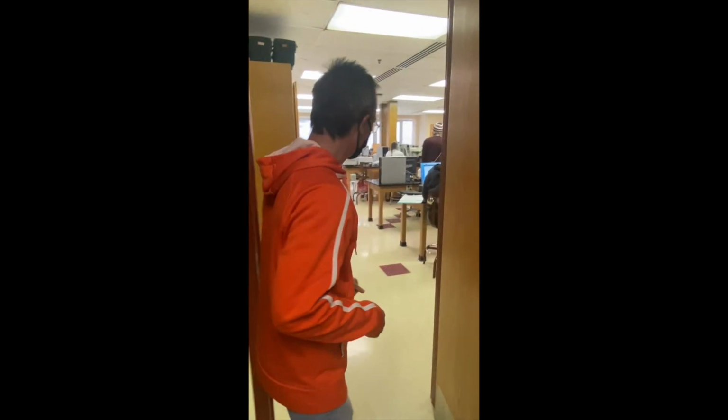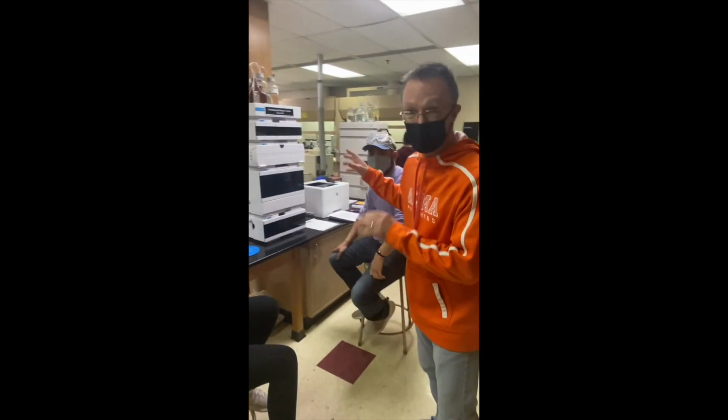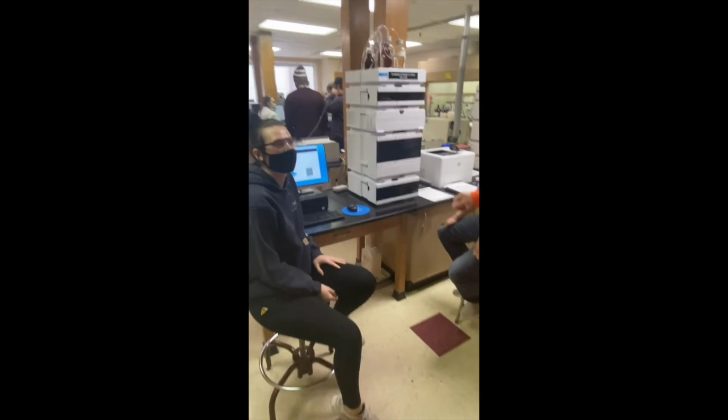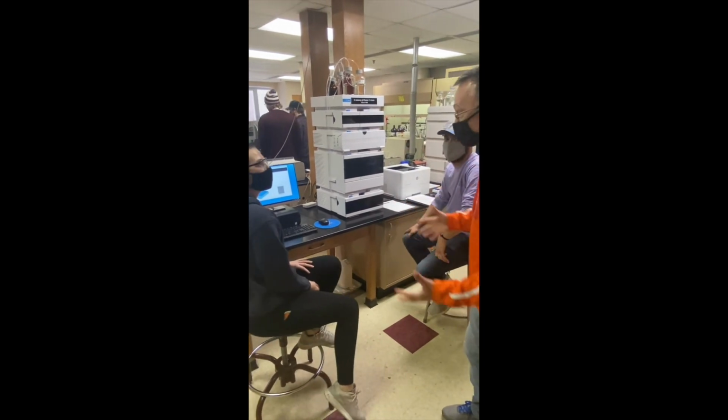Okay, so this laboratory houses some of our chemistry seniors and high-level science majors. They're working on chemical instrumentation, and I actually know what they're doing, so come on inside. This is Raquel and George. They're working on a high-performance liquid chromatography instrument. It was donated here just recently. This is a state-of-the-art instrument. What are you guys working on?